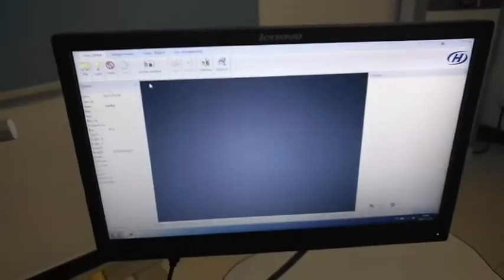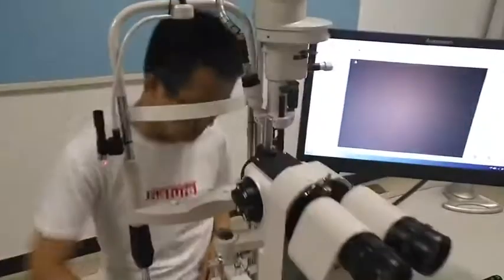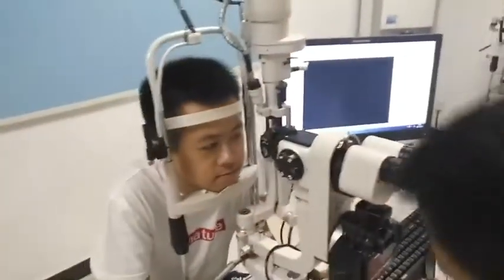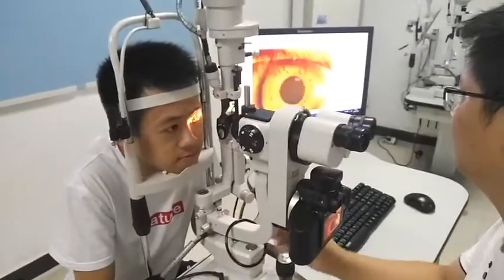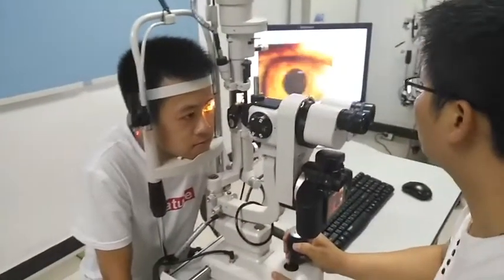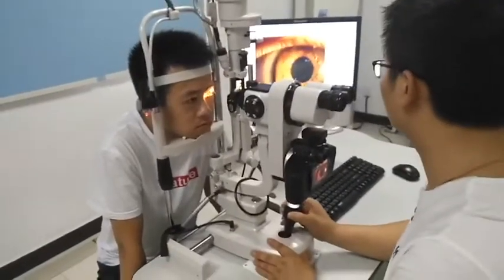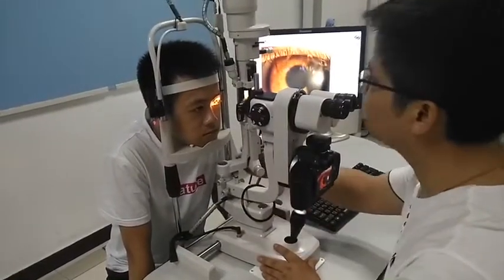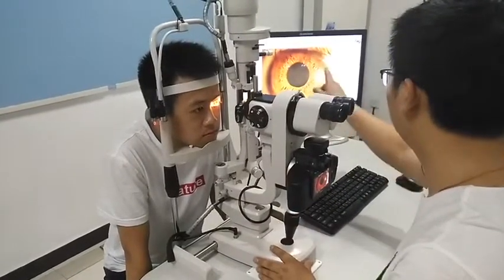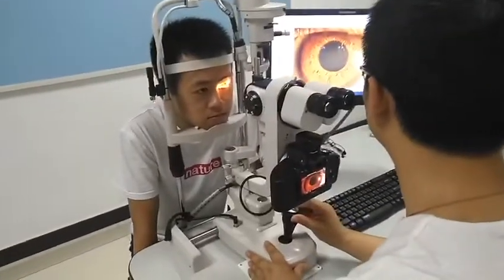Now I show you how to use the SM3ER to take a picture. Switch on the light. You can save the image. Adjust the platform to make the image clear, then press the button. The image comes here.